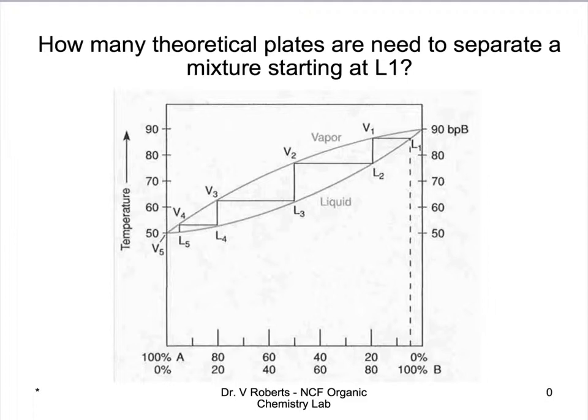But then I remembered that people had trouble seeing when the drop came out, so I don't want them to actually attach anything on this side. So they'll collect in a beaker, because they couldn't tell if there was a drop in there. It was hard, with condensation happening. It gets cloudy in here. Okay, so you can take it apart.